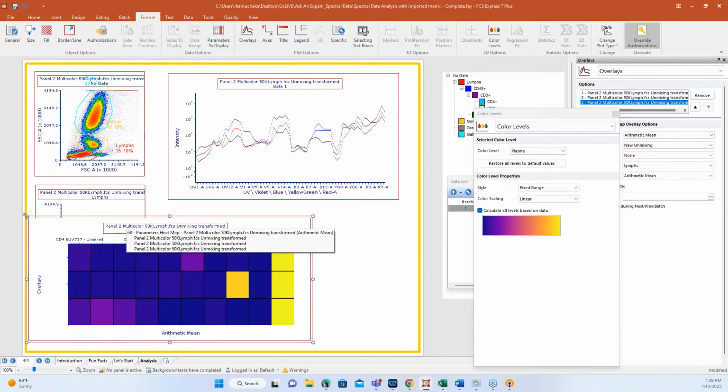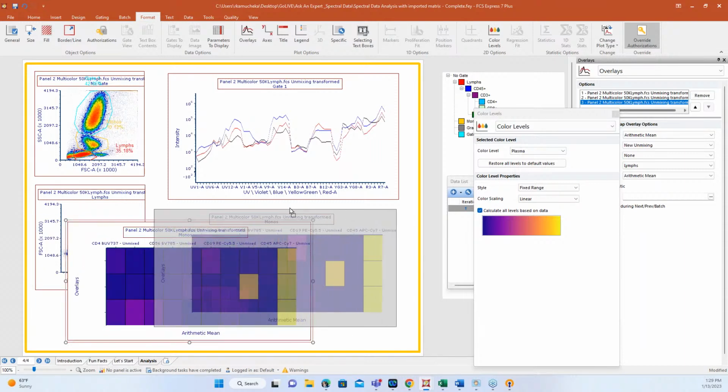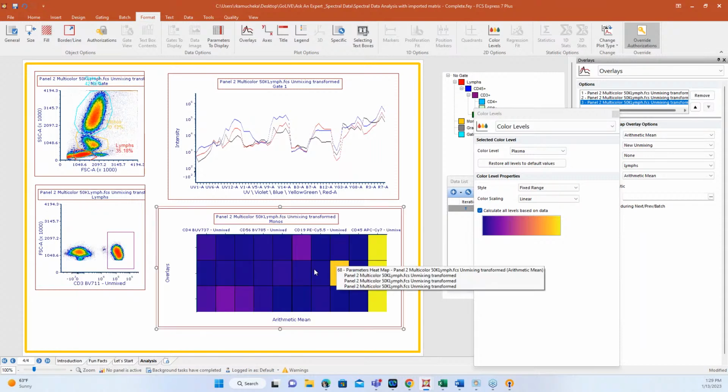And when you have these huge numbers of parameters, right, that's where you really get the benefit out of spectral data. I can do 40 parameters pretty easily without concerns of, is that a real signal or is it not? And being able to check down and check on my data, that's super important.